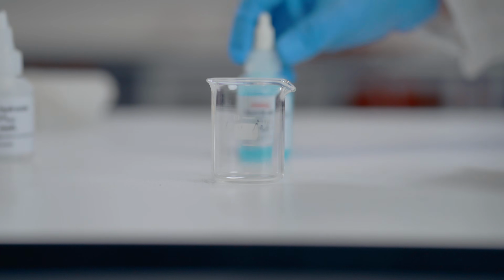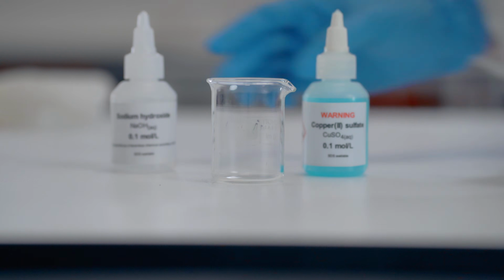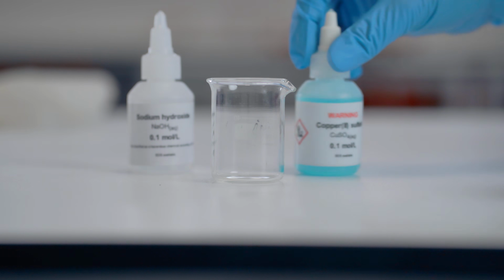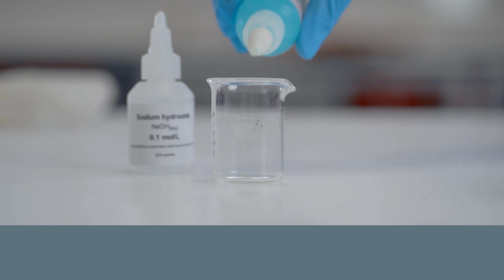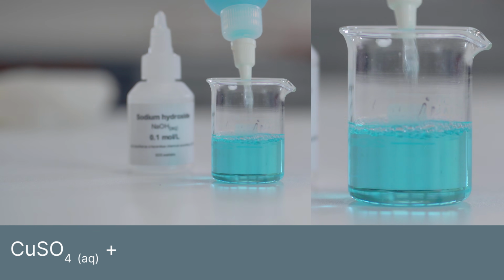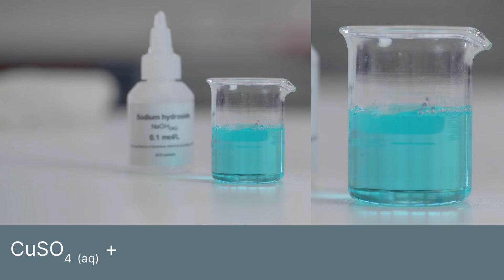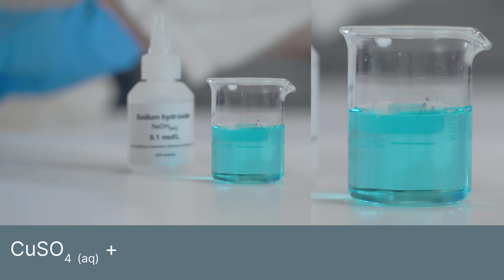Okay, this time around we're going to have these two chemicals. We've got copper sulfate versus sodium hydroxide. Now these are both very transparent liquids. Obviously this one here has a bit of color, so I just want to give you guys a better view of this, where you can see quite clear that it's a very transparent liquid. Just going to pour in as much as I can here. We've got a very dilute solution of copper sulfate. Normally it's a very intense, almost as blue as my glove when you have a higher concentration.